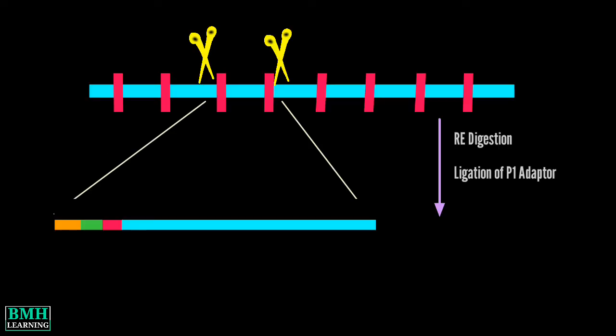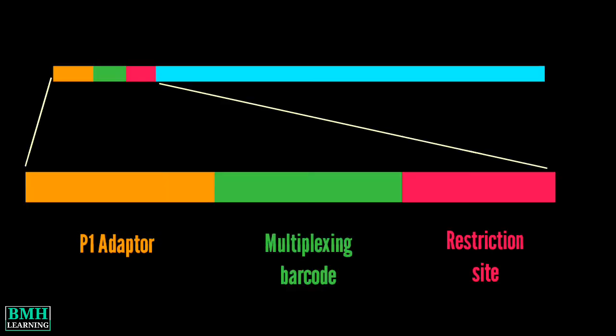How RAD-seq works? RAD-seq works by first fragmenting the target genome using a restriction enzyme. After digestion by a restriction enzyme, a first ligation allows to add to the DNA fragments a P1 adapter, complementary to the restriction site and barcoded for sample identification.